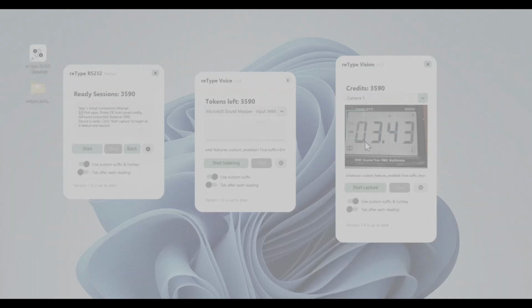If the device is not detected, check the cable, USB to serial adapter, driver, and COM port settings. Also make sure the instrument is set to the correct RS232 or serial output mode, not Wi-Fi or network mode. If detection gets stuck, try changing the saved COM port in the config.txt file to a different value, then save the file and try again.